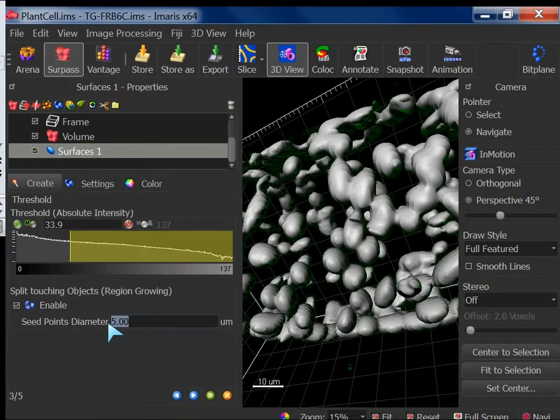And could it be that this one was not marked because we chose absolute instead of... No, it has nothing to do with absolute. Okay. So when you say this background subtraction, as I said before also, you can either switch on this background subtraction in the wizard, or you do it a priori in image processing, do background subtraction, create your channel, and then apply absolute. That is possible. So it's 2 options. But again, as she said, in that case it won't be remembered in the algorithm. So I think one should avoid that if you want to process many images similarly.